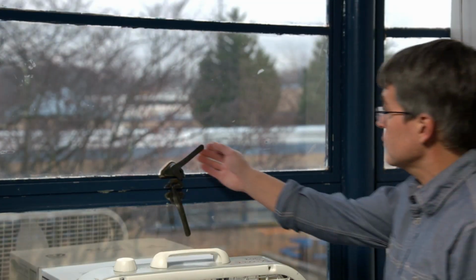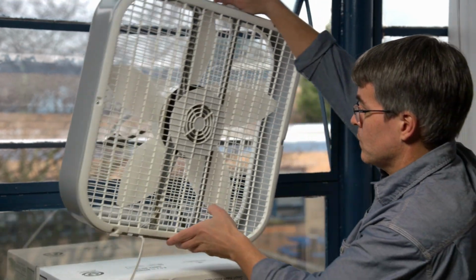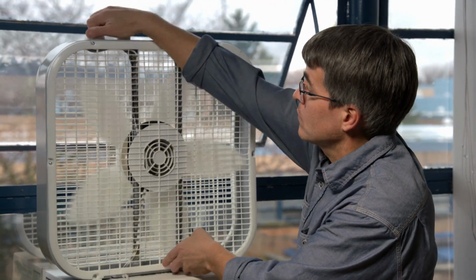Ventilate or air out as much of the spill area as possible. Open windows and position fans to blow mercury vapors out of the building. Finally, never use a vacuum or broom to try to clean up mercury. This breaks up mercury into small beads and will worsen the spread of the mercury.